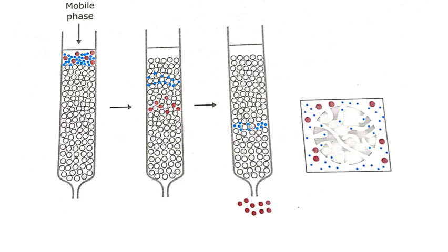These two types of molecules will be allowed to pass through the column, and then in the second picture we can see that brown molecules move faster, but the smaller blue molecules are moving a little bit slower than brown molecules.